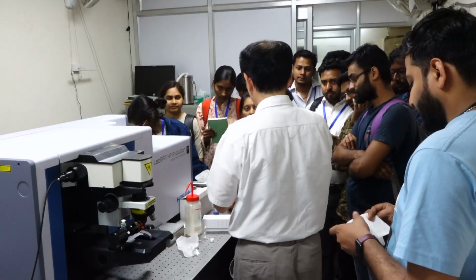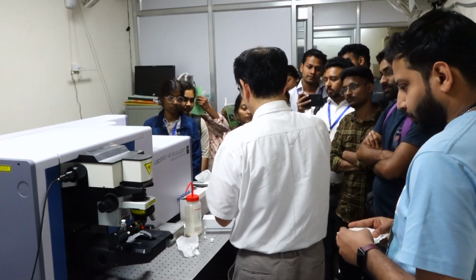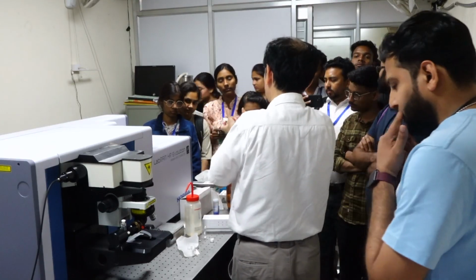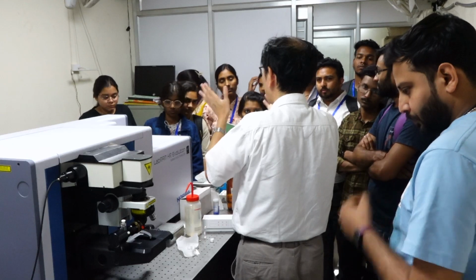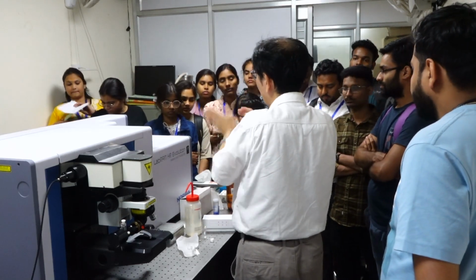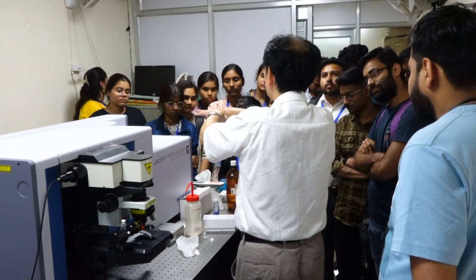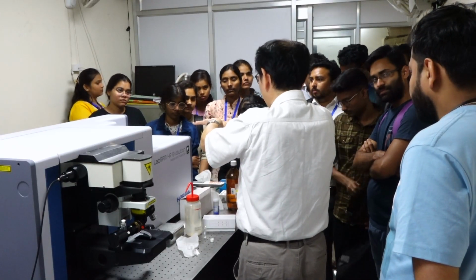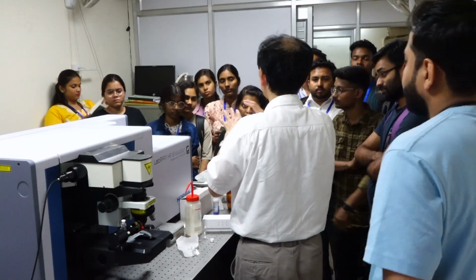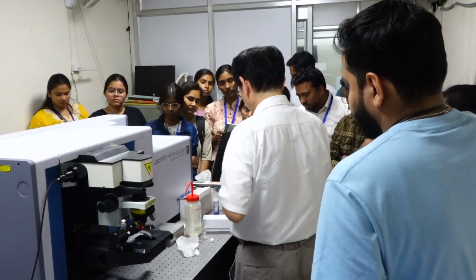In order to measure the Raman spectrum, we need excitation laser and sample cell, and we need to collect the scattered light and deliver to monochromator. Then grating disperses the mixed color into each color. Then we detect the Raman signal. Okay, so everything is in this box.